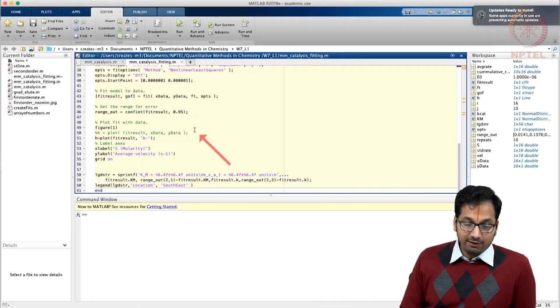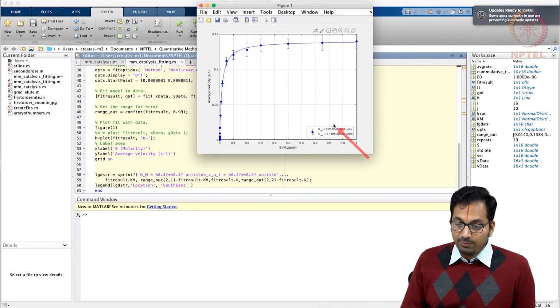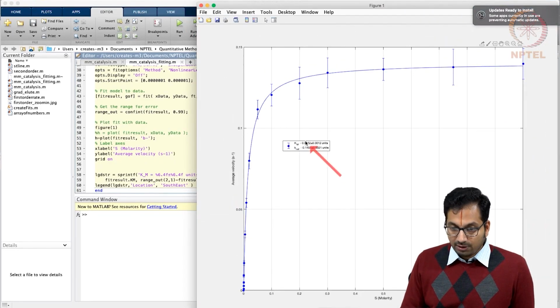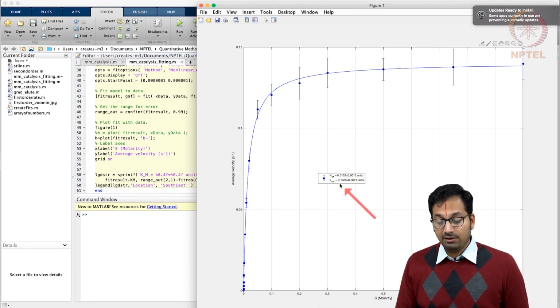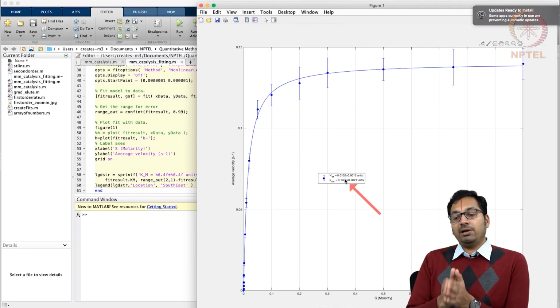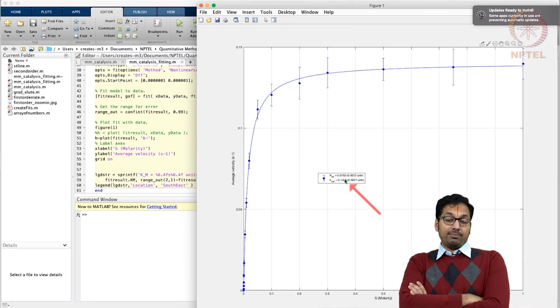Okay, so now that we have understood this, the same way fitting can be changed to other parameters as well. So if you want very high 3 standard deviations, you would be able to get these values also. And if you pay close attention to the legend that I plot, I am able to get the km and kcat values as well with the average and standard deviation. So one can fit curves at a much faster rate by doing this than by using a graphical user interface.